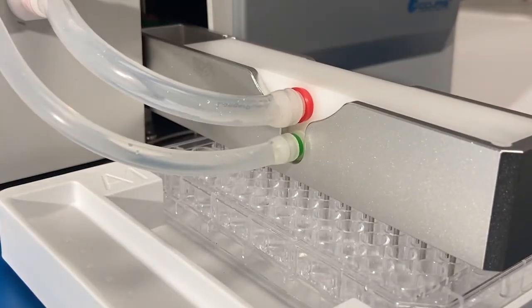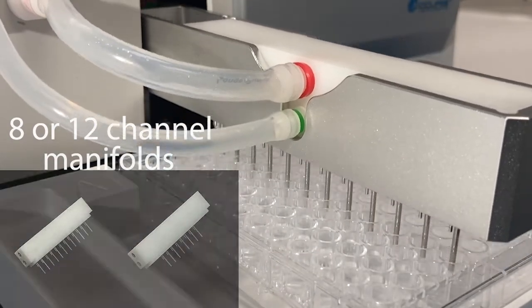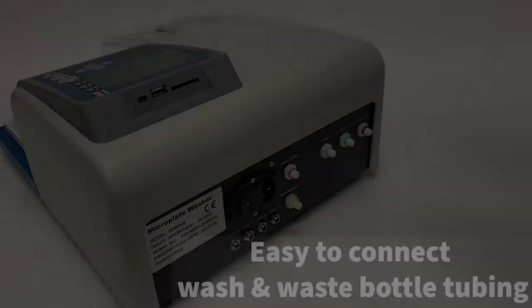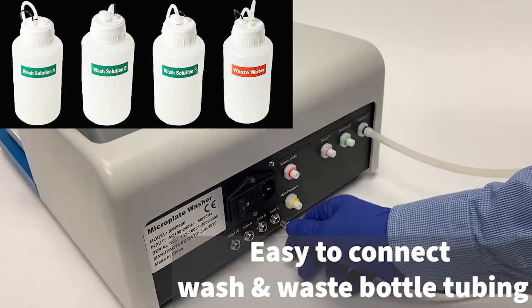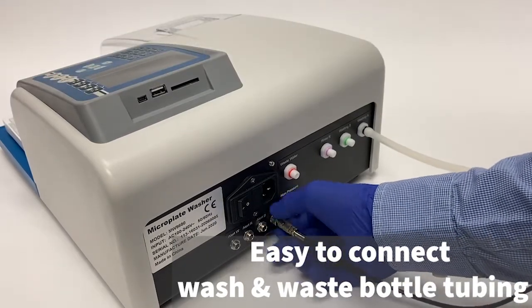The instrument uses an eight or 12-channel manifold wash head, purchased separately, and these are easily installed by connecting the dispensing and aspiration tubing lines. The back of the instrument has easy-to-connect, color-coded ports for two wash bottles, one rinse bottle, and one waste bottle. All wires and tubes are integrated into the bottle caps for simple assembly and bottle emptying.